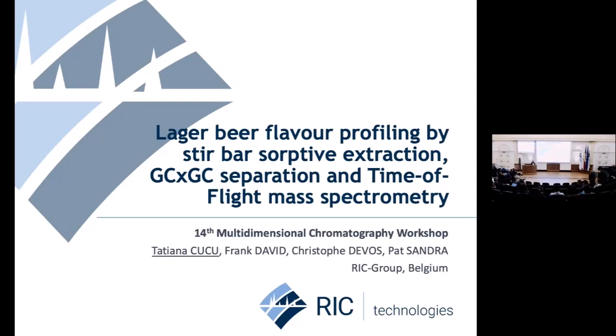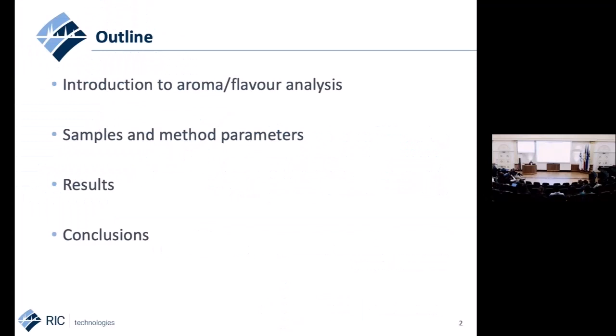But today I'm going to talk actually about lager beer profiling, flavor profiling with stir bar sorptive extraction and GC×GC separation and time-of-flight mass spectrometry. In the presentation today, I'm going to shortly talk about the importance of aroma and flavor analysis. I'm going to show you some of the methods and materials I have used for this study, show you some very interesting results we had in this analysis of the lager beer, and also some conclusions.